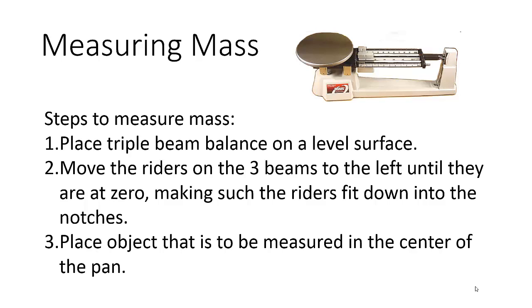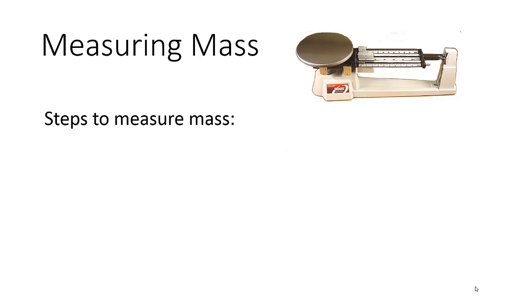Next step, place the object that is to be measured in the center of the pan. Make sure you don't put it on the sides because you want to make sure it stays on just in case it starts to roll.